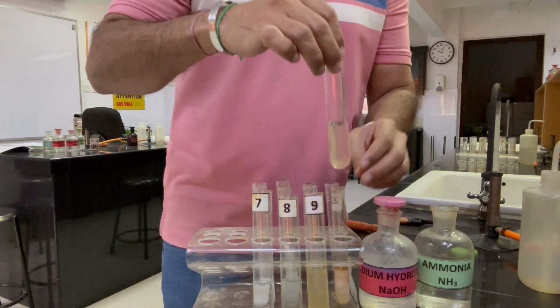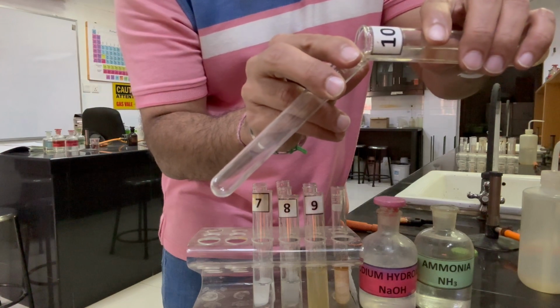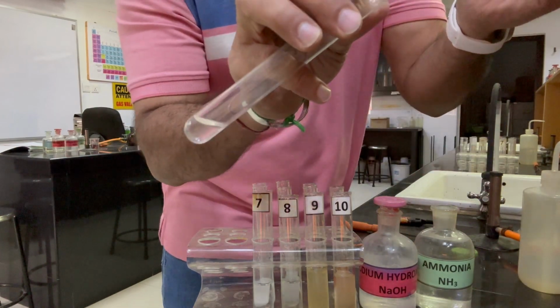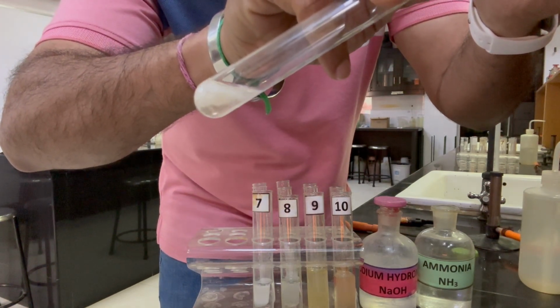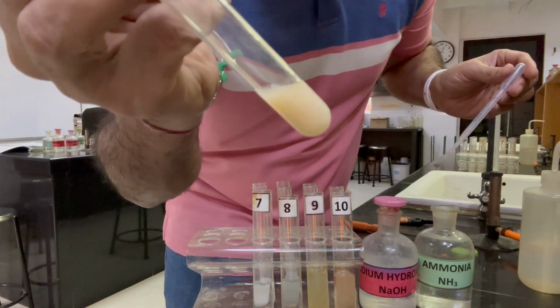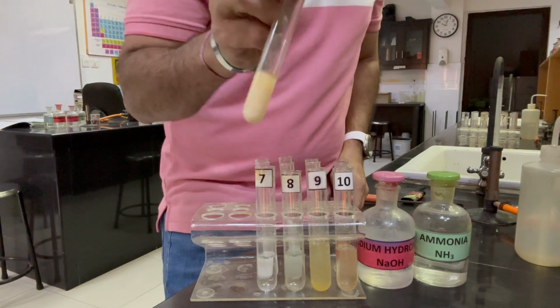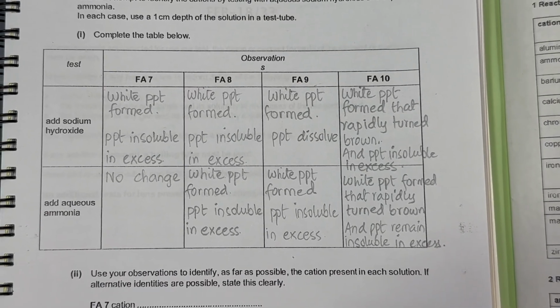Let's move on to the last one, Fa10, 1 centimeter depth. Again, aqueous ammonia, a few drops. So as soon as we add a few drops, white precipitates which are turning brown appear, and those white precipitates turning brown remain insoluble in excess. So let's record all these observations. So I have recorded all these observations here.